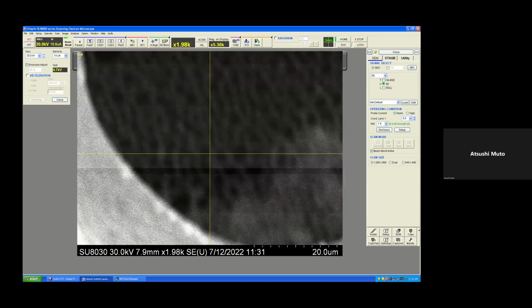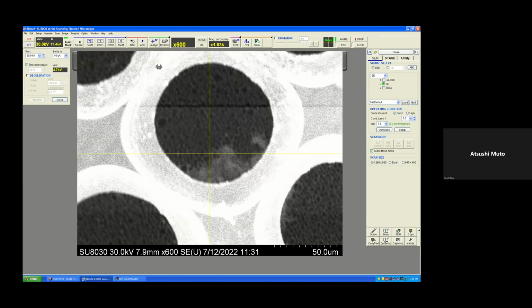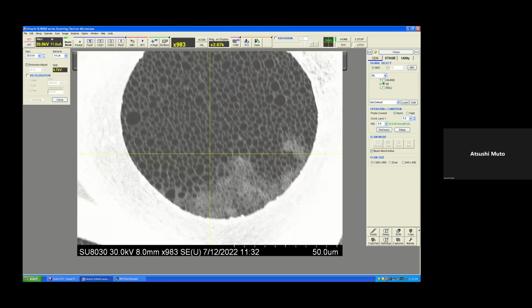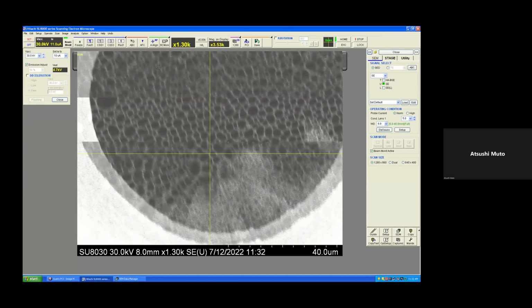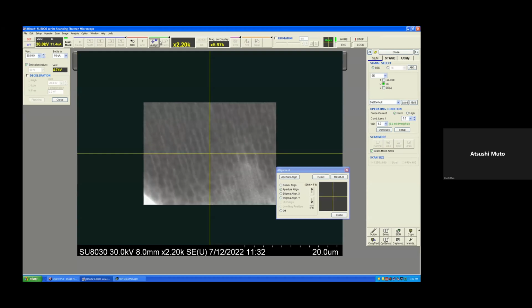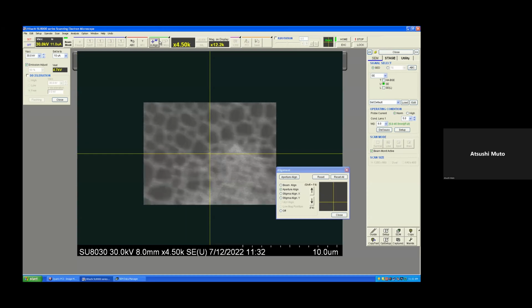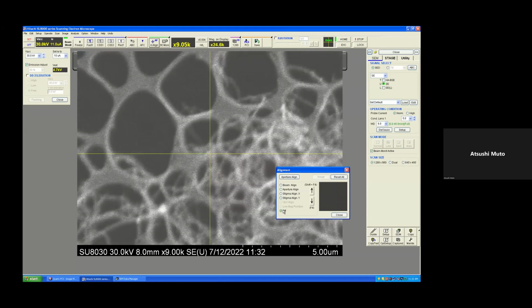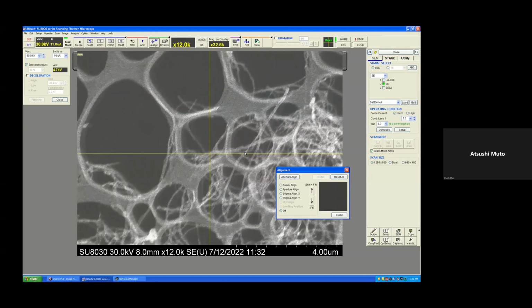First, this is a TEM grid. For TEM STEM imaging in the SEM, one of the good tips is appropriate selection of the TEM grid. I prefer to use this lacey carbon grid, which has holey structures. If a material like a carbon nanotube can go across this kind of lacey structure, we have a good chance to get good penetration without interacting with the base materials, so a better chance to get good data.